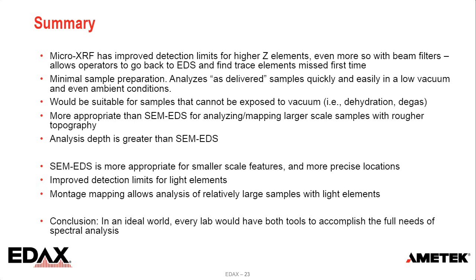Next question is, what is the total measuring time for a montage with EDS? So the answer is, it depends. It depends on the collection parameters you use. Like for the first montage I showed in this presentation, which is the entire geologic section, I used more than 20 hours to collect that montage map because I used higher quality to collect the sample.